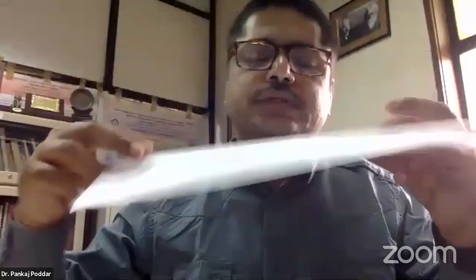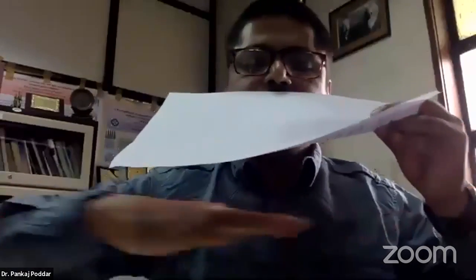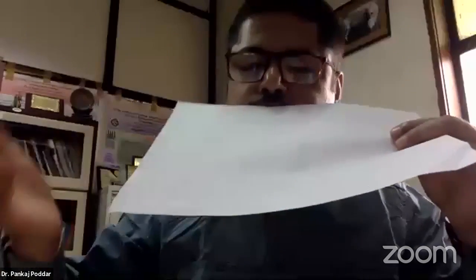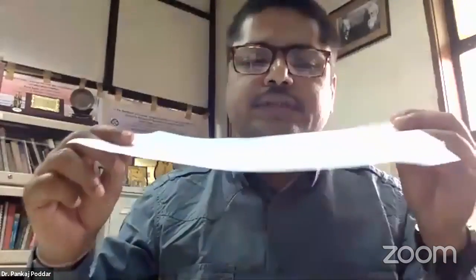So they're not necessarily flat, so it's better. Now the question comes: if the sample is like this or like this, when the electron beam is passing through the entire sample, what will be the changes? What do we expect the changes in electron diffraction and real images? I'll show you examples from my own lab, and a few slides in future lectures are reserved to understand this, and this becomes very useful. You start getting these fringes, very nice fringes, and a lot of work in electron microscopy.